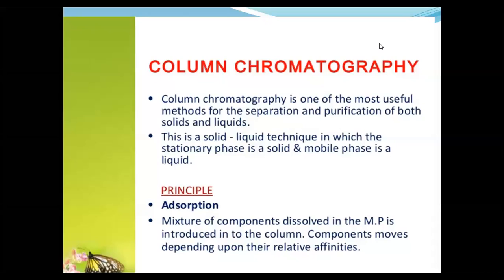So good morning everyone. Today we are going to discuss another topic of unit 1, that is column chromatography. Column chromatography is also one of the separation techniques. In this column chromatography we use a column. Previously we have used thin layer chromatography and then paper chromatography.